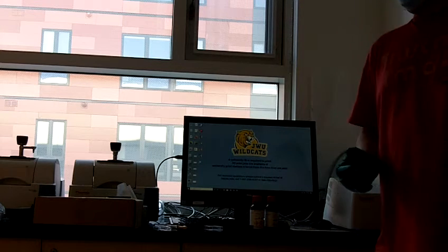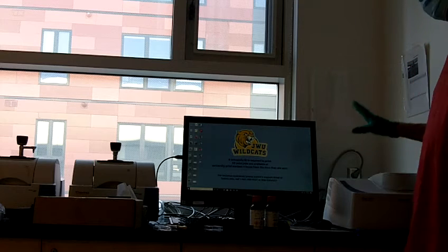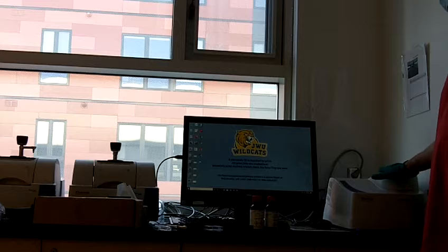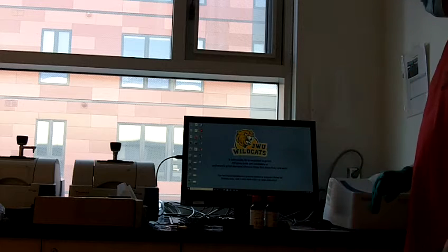So in this part of this experiment, we're going to be working with ultraviolet spectroscopy. You can find our ultraviolet spectrometer back here in the back corner of the lab. We actually have it hooked up to the same computer as one of the infrared spectrometers.